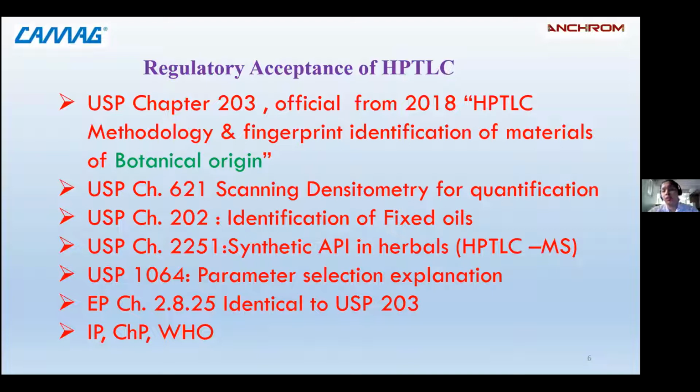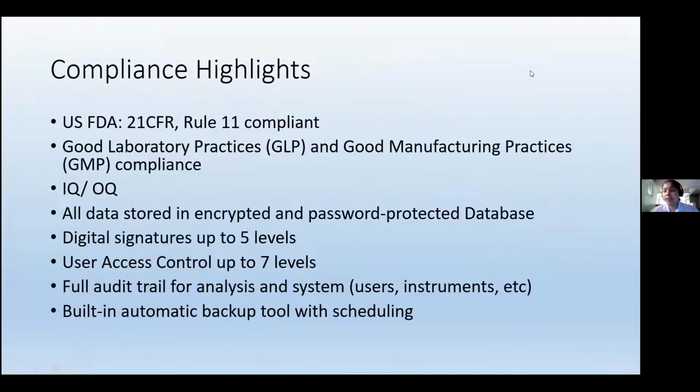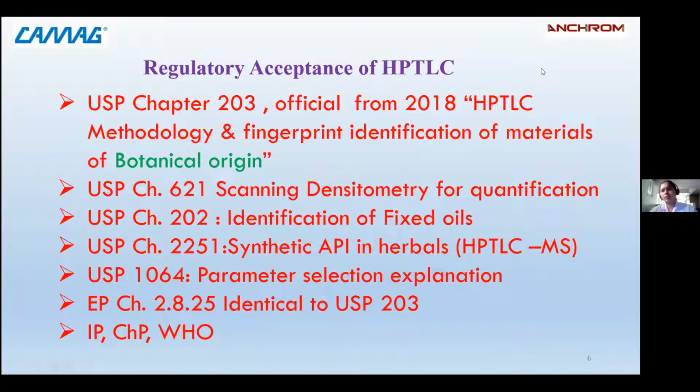Now, what is the regulatory acceptance? So I am only telling that it is regulatory accepted. So these are the things which are accepted. These are the acceptances of HPTLC.